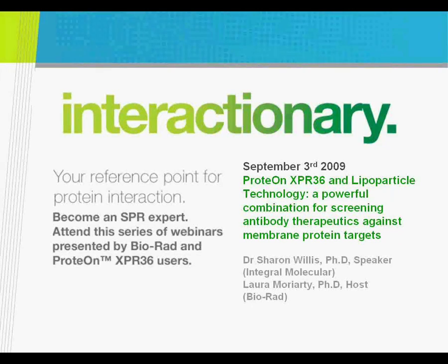So it works really well, and then you can interrogate your nucleotide with a protein, or you can interrogate it with another nucleotide. The only issue is the size of your molecule and how sensitive your event can be.